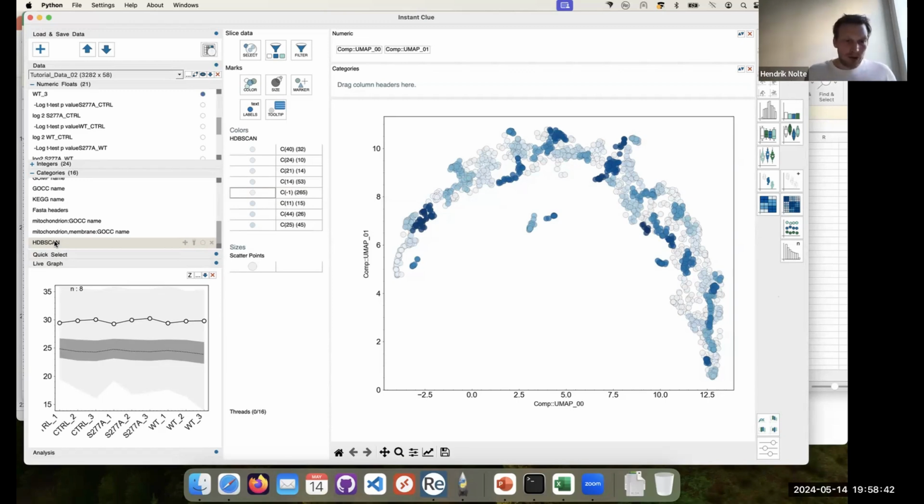And at the moment, I'm showing you this for three groups, but this can really be extended to numerous groups, up to 20 groups. In the beginning, it is a bit tricky to get the right settings, but over time, you will get a feeling for what's good for your data. And then it's a very dense representation of the data. What I mean by that is that you have a lot of information in a single graph. And yeah, that is what I wanted to show you.